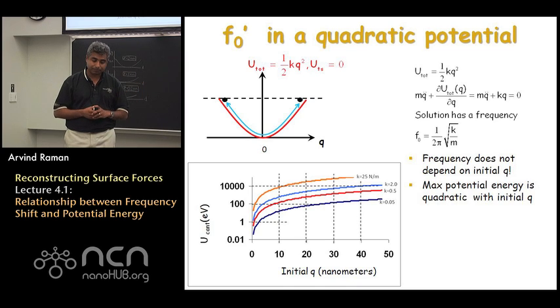which is sketched on the left. What's going to happen is, if you imagine this potential well, if you were to take a ball, started off a certain height, and let it go, it would roll and go up to the same height on the other side of the well and turn around, go all the way back up, and it would keep oscillating like that forever since there's no dissipation.